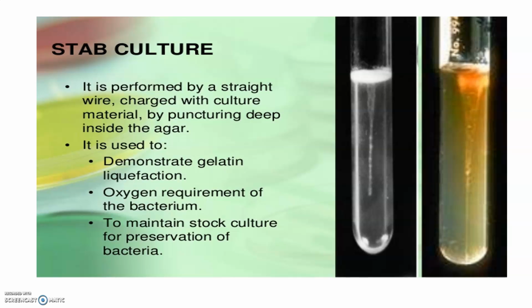This is the picture of stab culture. It is performed by a straight wire charged with culture material by puncturing deep inside the agar. While performing stab culture, we are not touching the deep end of the tube. Some of them are puncturing up to this point, but it is better to puncture up to this point or this point. There is no need of touching the deep end.